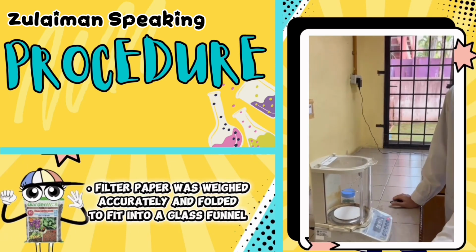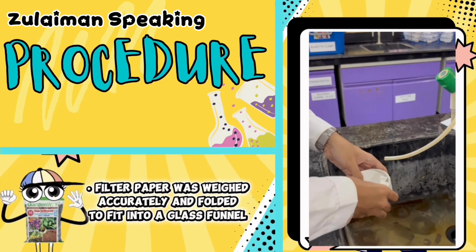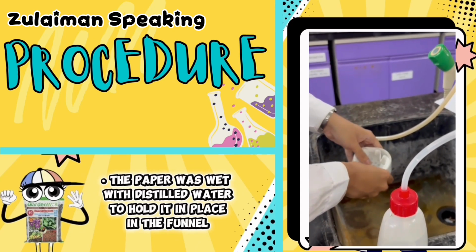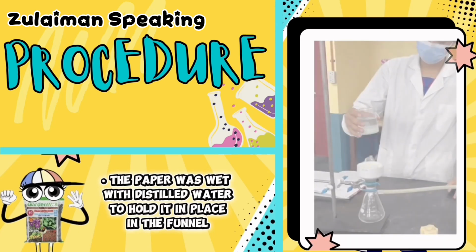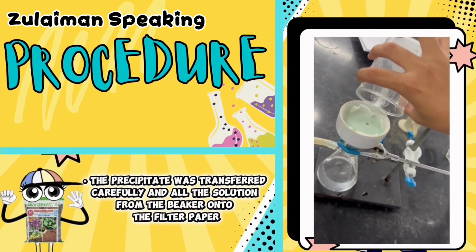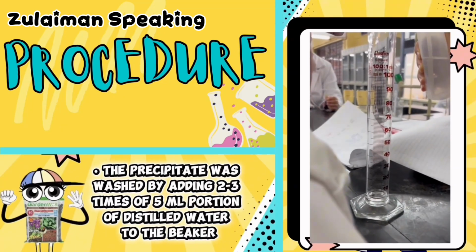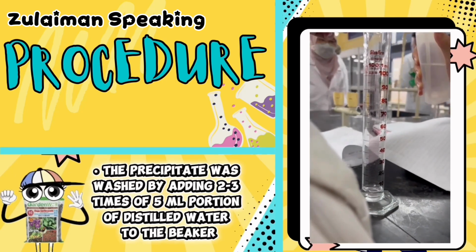After that, filter paper was weighed accurately and folded to fit into a glass funnel. The paper was wet with distilled water to hold it in place in the funnel. The precipitate and all the solution from the beaker were transferred carefully onto the filter paper. The precipitate was washed by adding 2 to 3 portions of 5 ml distilled water to the beaker.